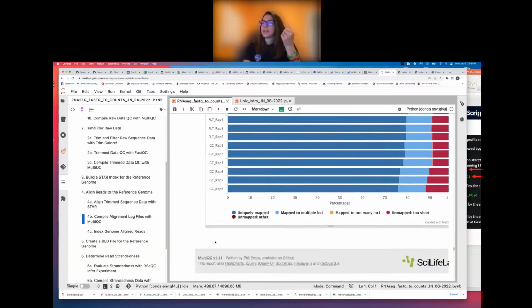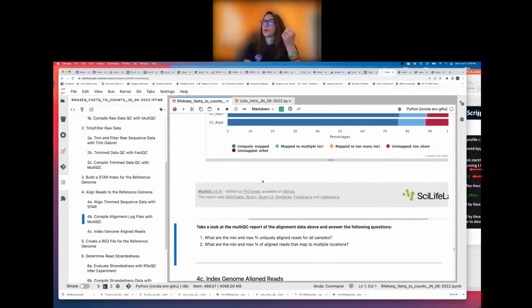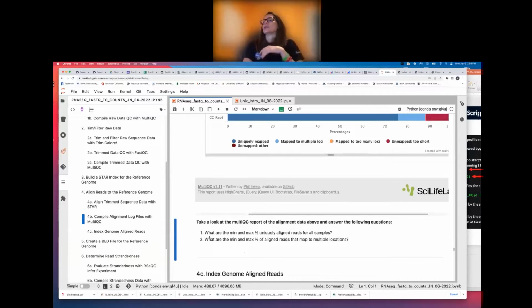So I want you guys to take a look at that MultiQC report and answer these questions. So Lisa, if you could cue this question up. The first one here is, what are the min and max % uniquely aligned reads for all samples? So the min and max % uniquely aligned reads, we'll answer that one first. I'll give you guys all a few seconds to answer that.